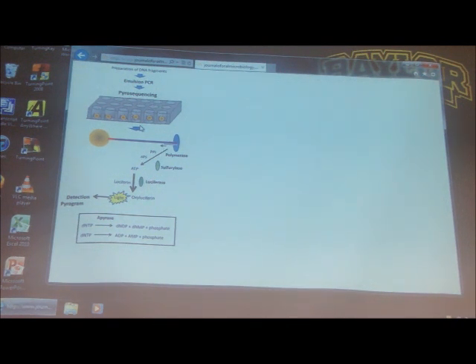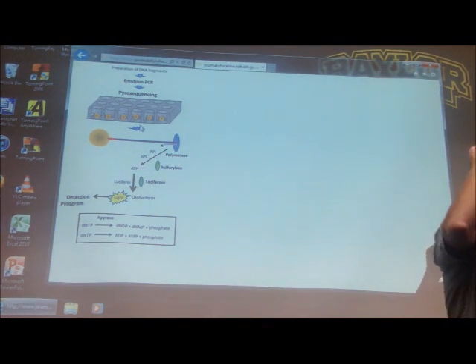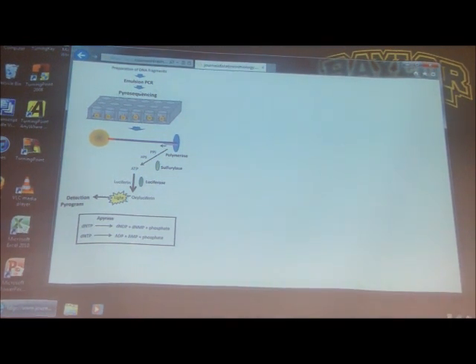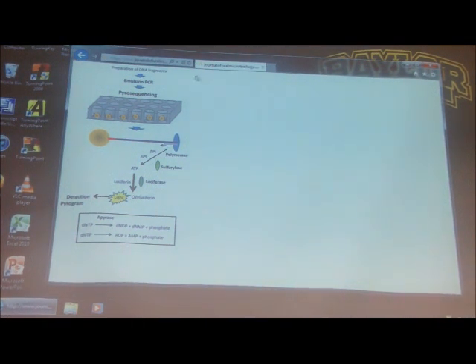It seems quite lengthy, but of course you can do like 100,000 of these sequences all at once. And so you can look at 100,000 of these, and your read is pretty long. I think it's a couple hundred bases you can read this way. So that's pretty long. Not as long as Sanger, but it's still pretty good. So that is the 454 sequencing.